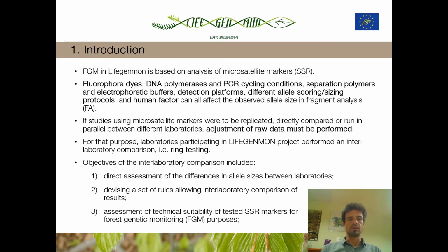Forest genetic monitoring in Lifegenmon is based on analysis of microsatellite markers. The observed allele size in fragment analysis of microsatellite markers depends on many different factors, from chemicals used through detection platforms and human factor. Thus making direct comparison of results of microsatellite analysis between different laboratories very difficult without adjustment of raw data. For that purpose, laboratories participating in Lifegenmon performed an interlaboratory comparison.